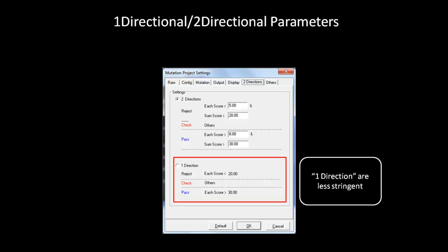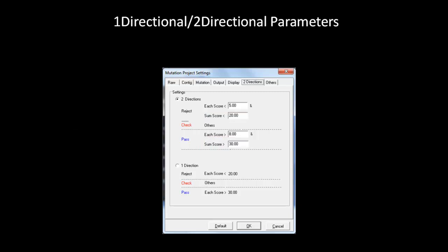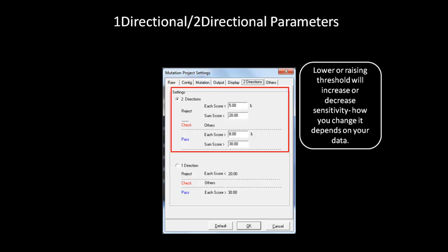If you have a mixture of 1D and 2D data, there are a few things you should know. When analyzing 1D data under 2D parameters, the sum score is reduced by dividing the set number by the square root of 2. If this number is still too stringent, there are a couple of options you can take. The first option is to separate the files into 1D and 2D groups and then analyze each set with the appropriate settings. The second option is to lower the threshold set in the 2D parameters in hopes of calling all the mutations in your 1D samples.